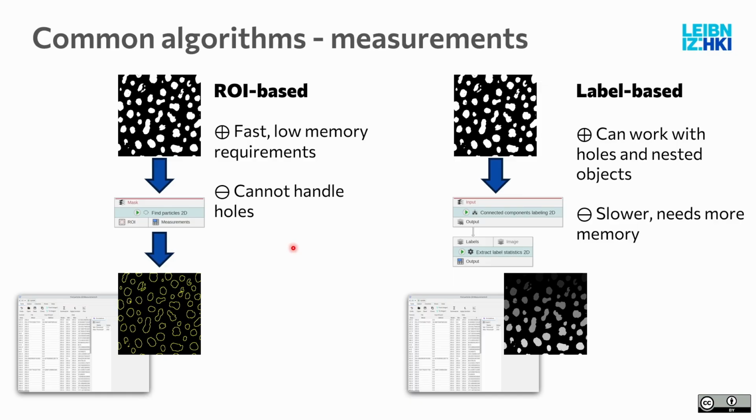But you were able to make some in ImageJ that have holes, and this is possible because ImageJ has composite ROIs, where you have multiple ROIs stacked into each other, and then they work around that issue to introduce holes artificially. I would not rely on those, because some ImageJ algorithms absolutely do not like these composite ROIs, and then you get weird results out of those.